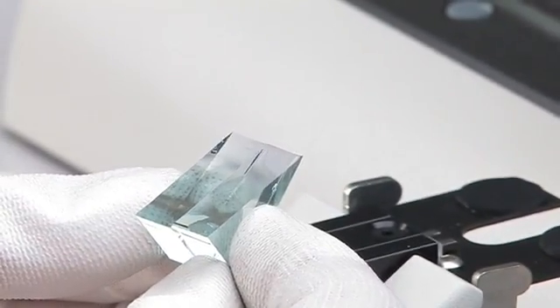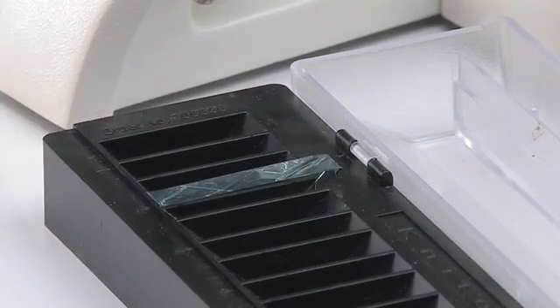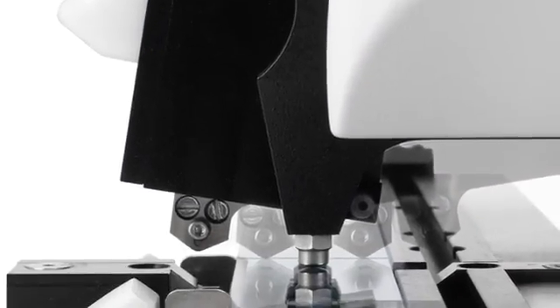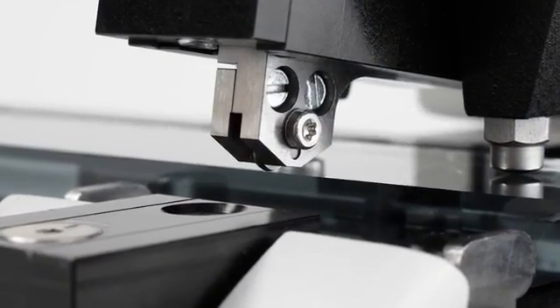All the new features of the Leica EMKMR3 help make the production of glass knives easier and more reproducible for electron as well as light microscopy sectioning techniques. For students, routine users, through to the demands of the experienced cryo-ultramicrotomist, the new Leica EMKMR3 is the unsurpassed instrument of choice for producing high-quality glass knives.